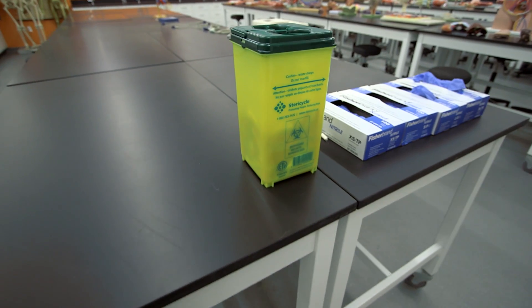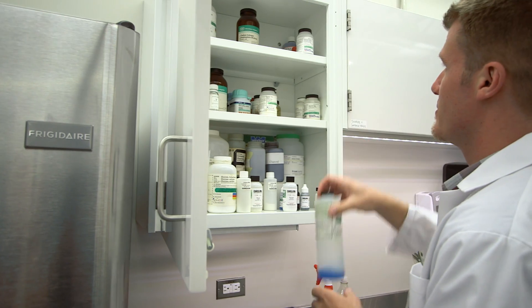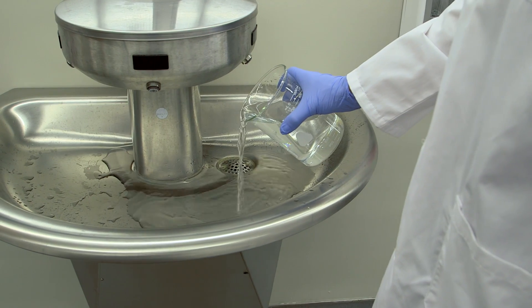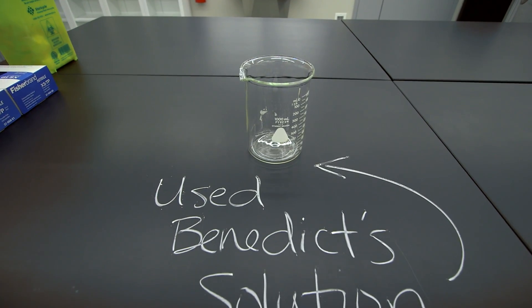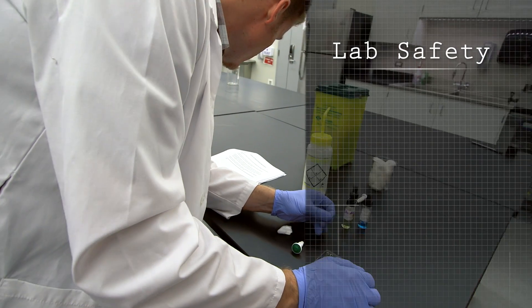We have sharps disposal containers that are out when necessary, or kept in the cadaver lab. When we're doing physiology experiments, we may need to do some chemical disposal. Some chemicals can go down the drain; others must be disposed of using special precautions. Be sure to pay attention to the instructions given during the lab talk.